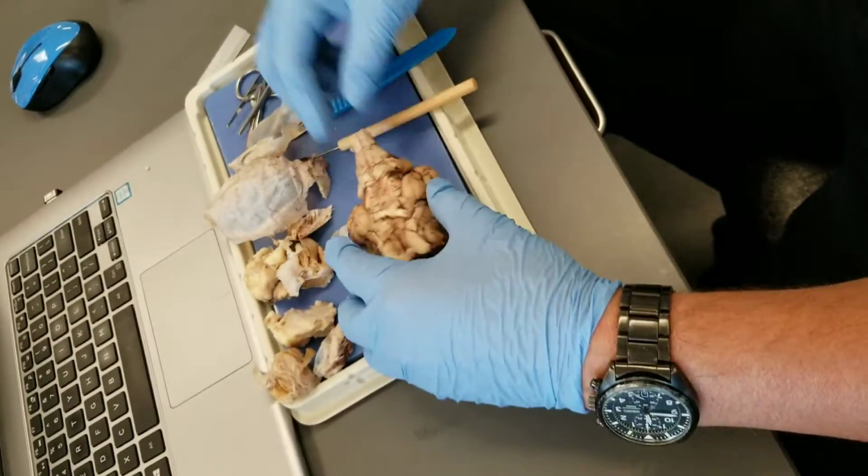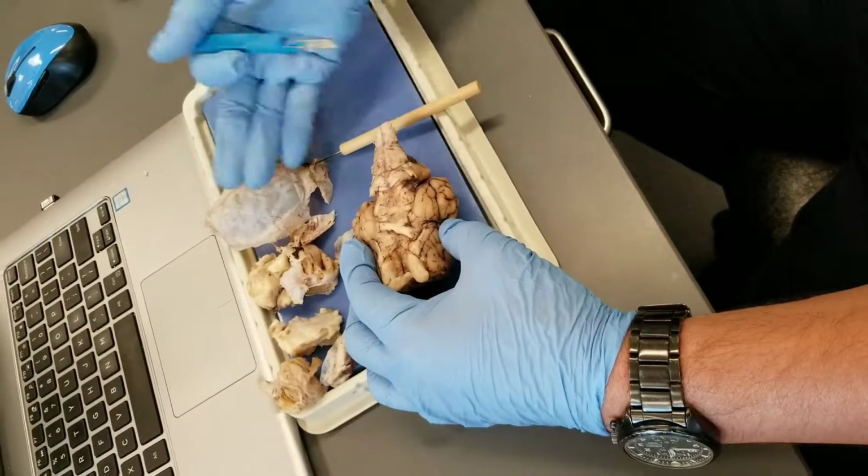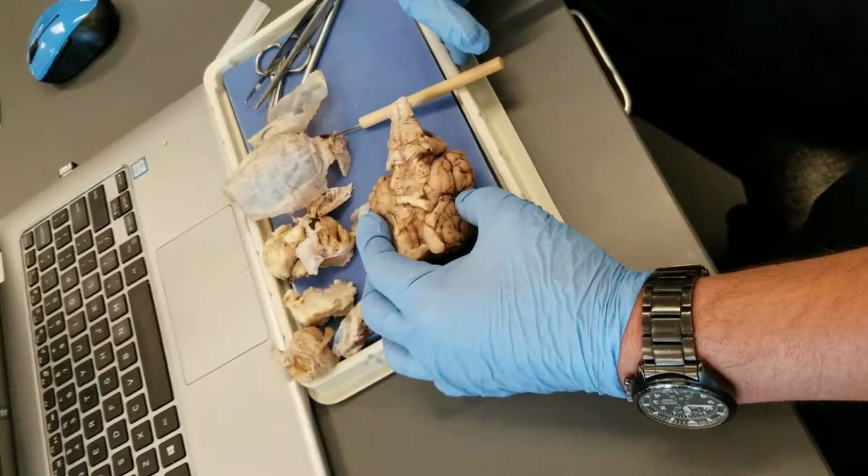Okay. And then to see the internal structures, we're just going to make a mid-sagittal cut right down there, and we're going to cut it into two halves. Okay, I'll do that in a sec.